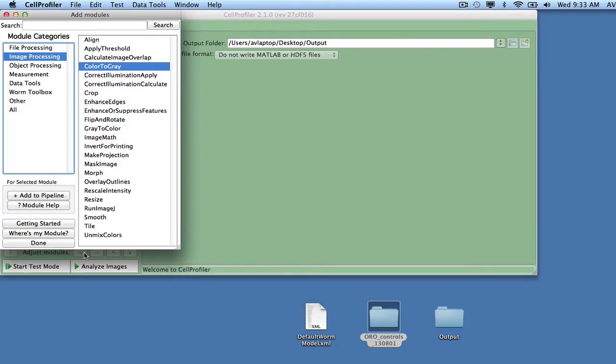Most object detection methods in CellProfiler are designed for bright objects in a dark background. Since the input images are color images of a bright background, the first thing we need to do is to invert the image pixel intensities, adding the module called ImageMath located under the module category Image Processing.